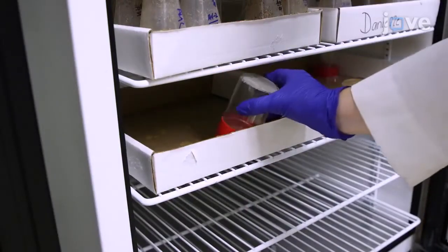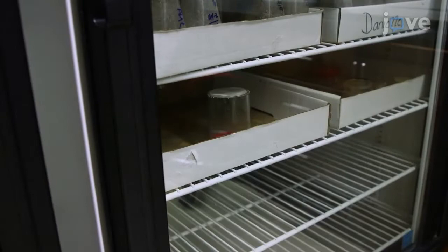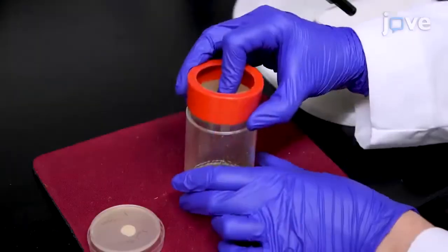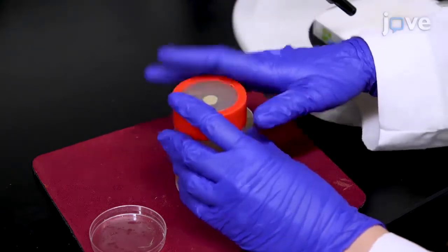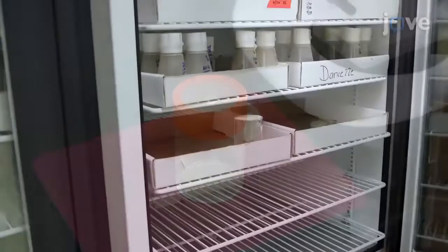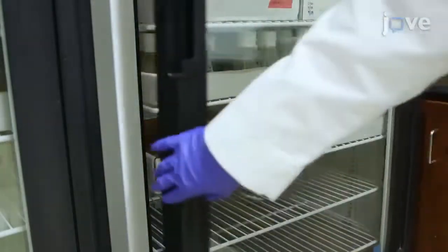To clear older embryos, allow the flies to lay eggs on an apple juice agar plate for one hour at 25 degrees Celsius. At the end of the incubation, invert the cage mesh side down and tap the flies to the bottom of the cage. Replace the apple juice agar with a new pre-warmed apple juice agar plate with a small smear of yeast paste and allow the flies to lay eggs on the new plate for another hour at 25 degrees Celsius.